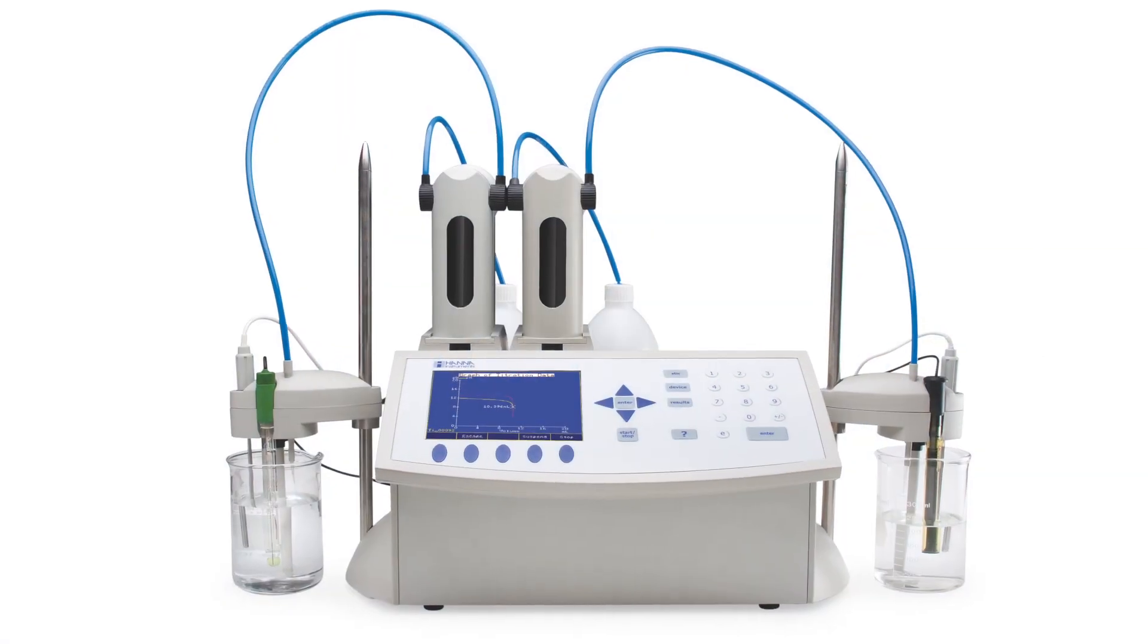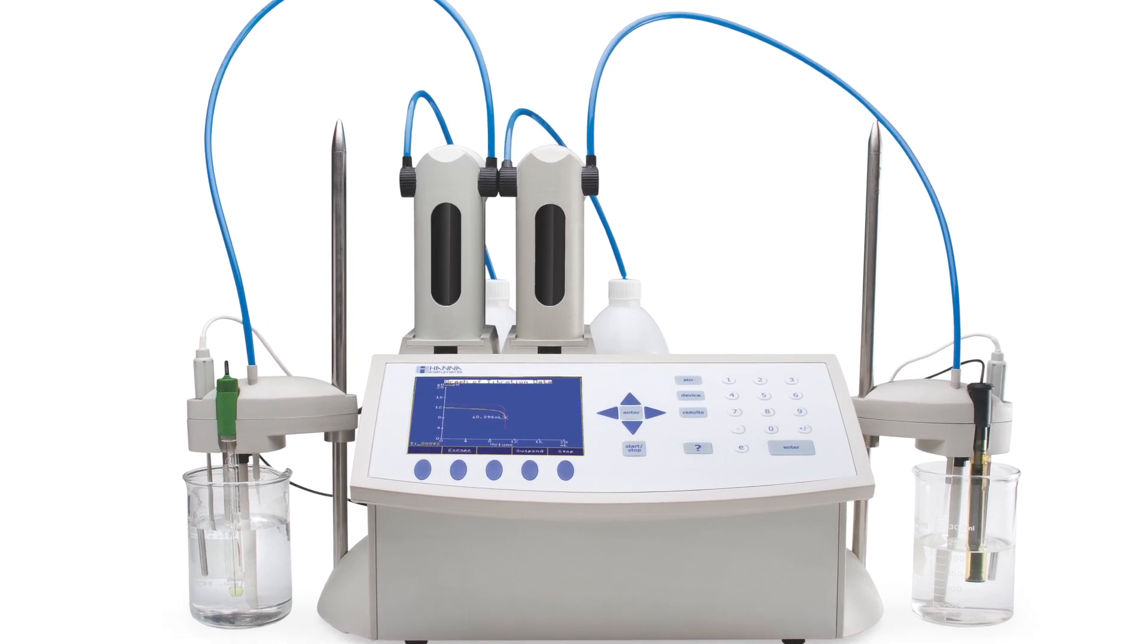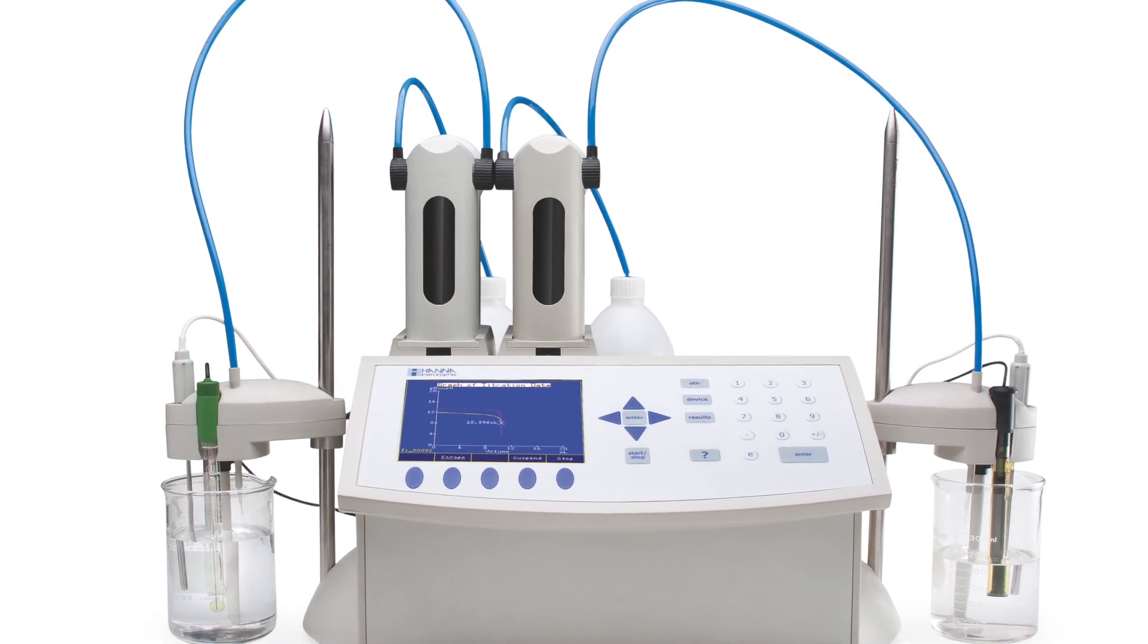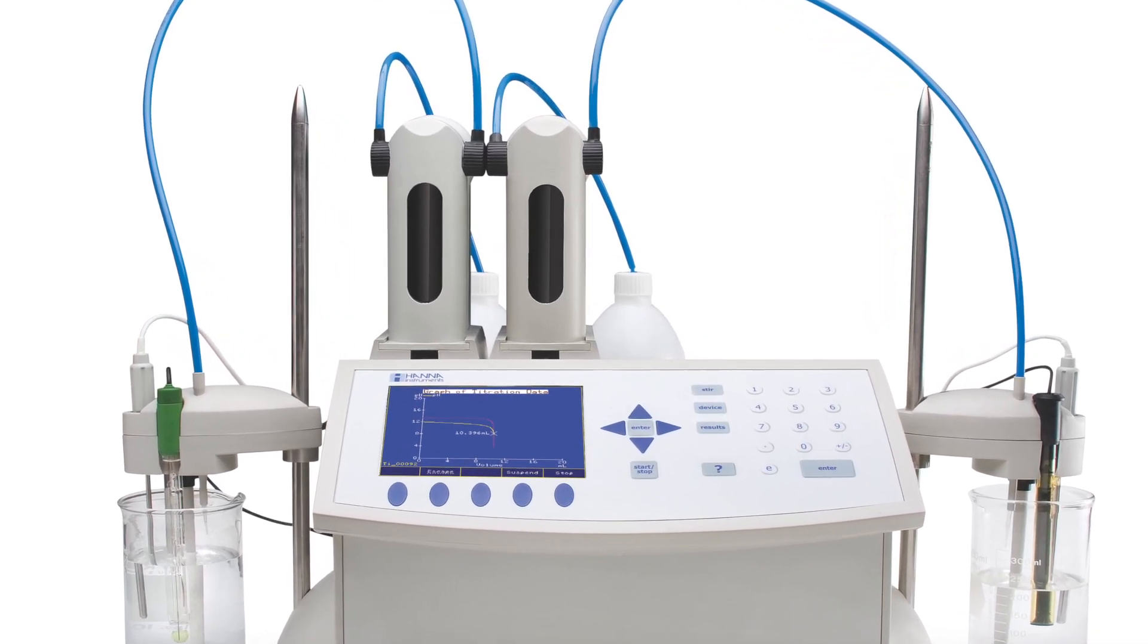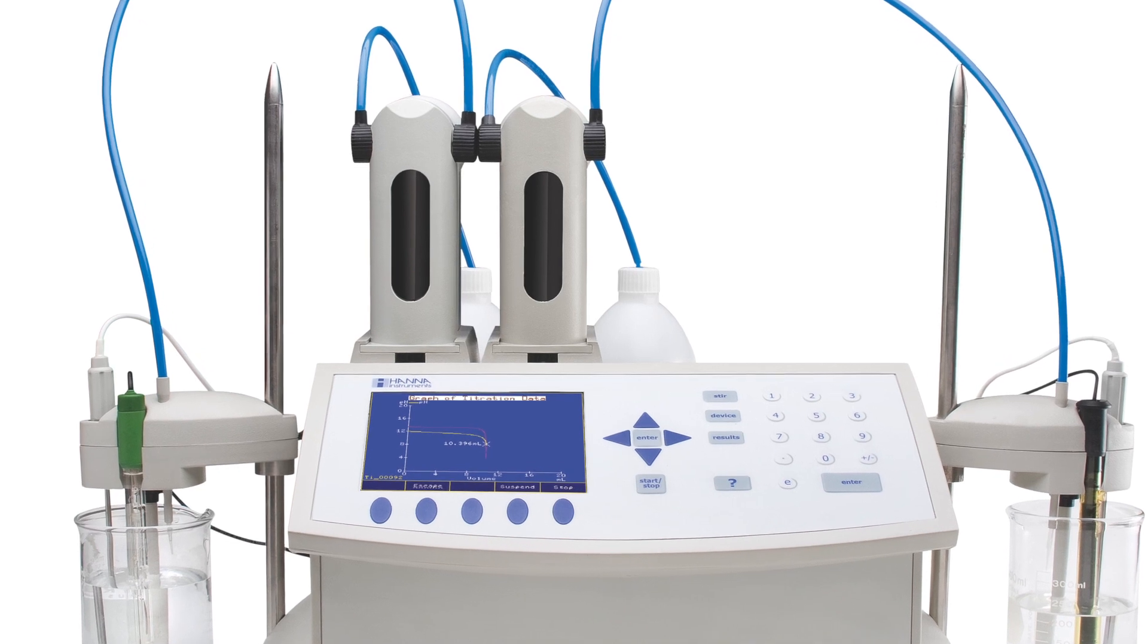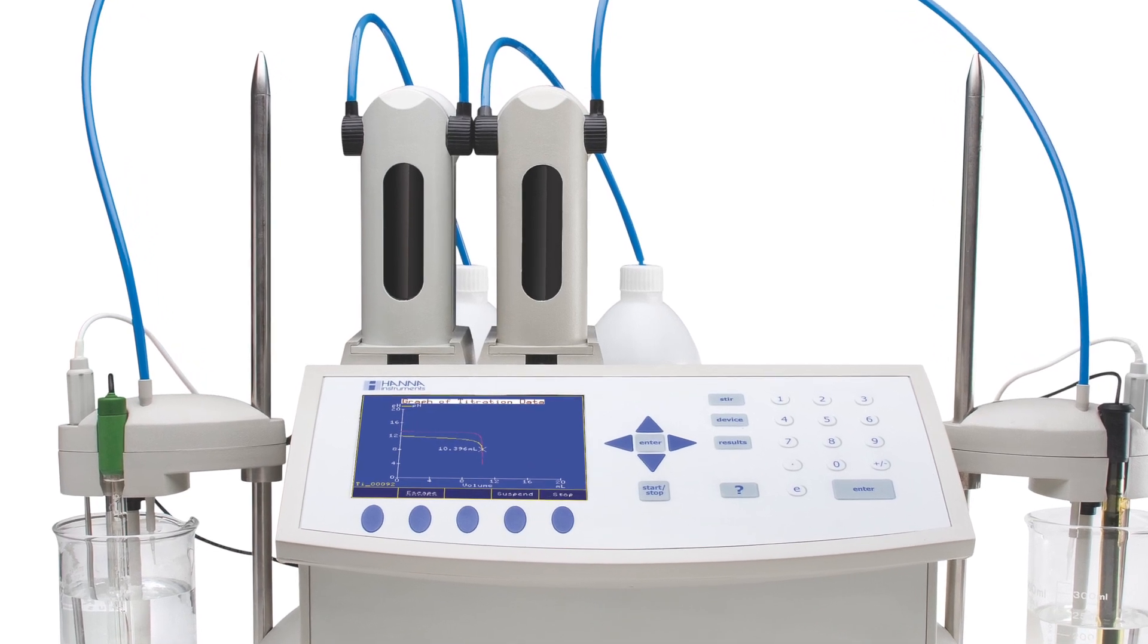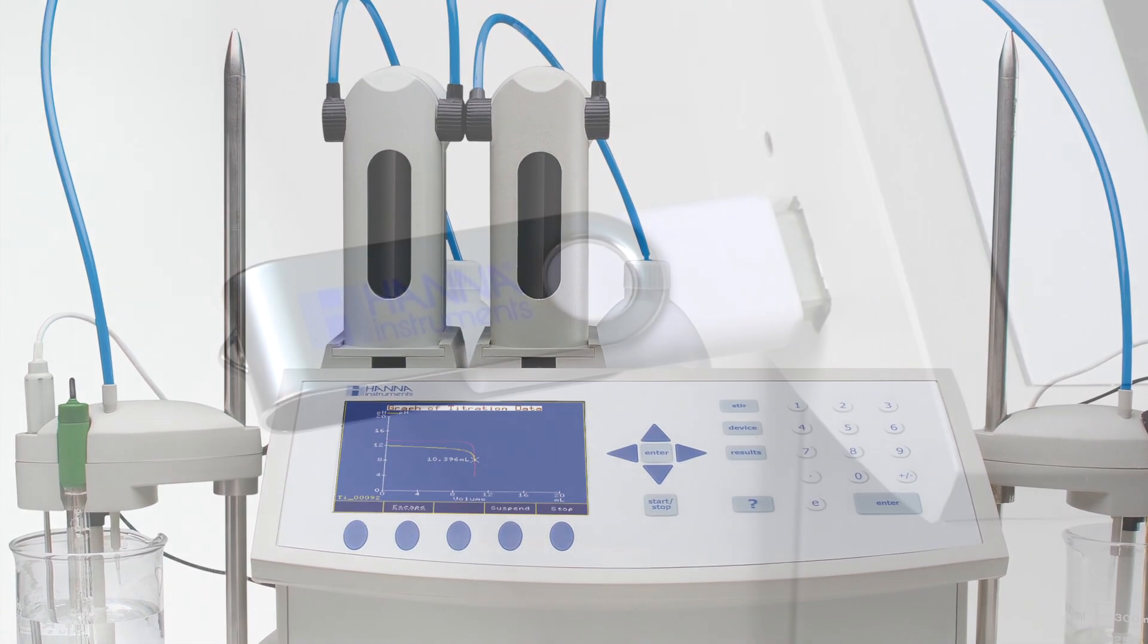The HANNA Instruments Automatic Titrators can store up to 100 standard and user methods, and up to 100 titration reports. Transferring files between the titrator and a USB storage device is fast and easy.